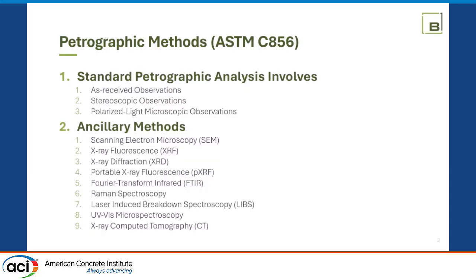You can get some real material characterizations there. I'm a diffractionist at heart, so XRD is at the heart of my soul when it comes to petrography. If I could scan it with an XRD, I'm happy. But it's not always practical.